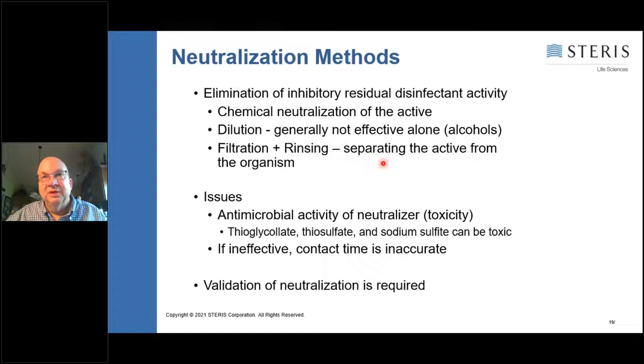And keep in mind that you want to make sure that you're not actually killing the host cells. So some neutralizers like thioglycolate, thiosulfate, which is used with bleach, sodium sulfite, some of these can be toxic to the cell. You want to make sure whatever neutralizer you're using is not actually killing the cells.